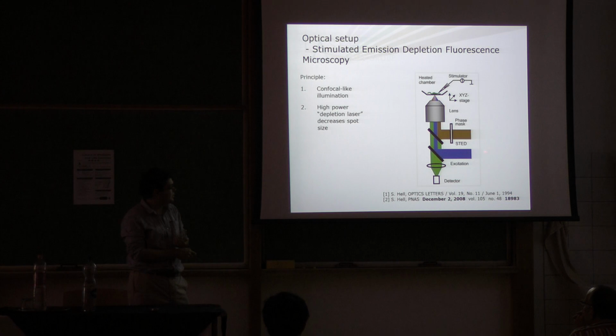Okay, sure. So I've color coded this. The blue, and it comes out as brown, but it's meant to be sort of red. The brown light and the blue light are both the illumination. So they're being focused, and reflected off suitable dichroic mirrors. The green is reflected.